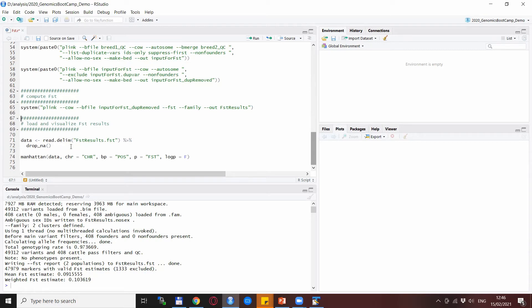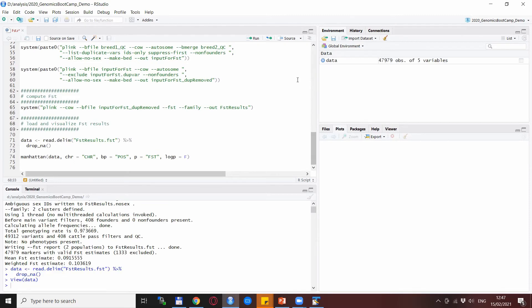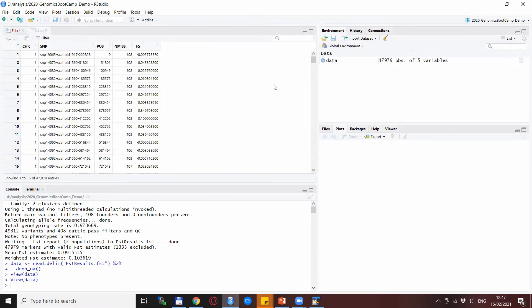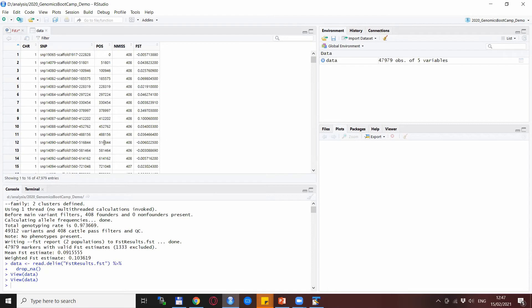Now in this case, some of the lines have an NA value, so we need to drop those. Before plotting, let's actually look at the data. You see it's chromosome, SNP name, and position, but most importantly the FST values.